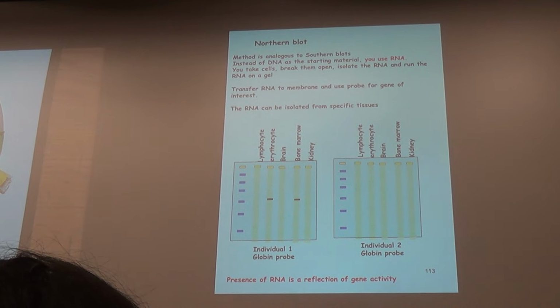And you'll be able to say, aha, now I know after 30,000 days, or however many years that is, you will get a picture of the entire human genome with regards to which genes are active in which cell types. So you can use Northern blots to do that. It's extremely slow and time consuming because you can analyze one gene at a time with one filter. There is a new method that was developed in the 1990s called microarrays. And that allows you to get a picture of the entire genome, all 30,000 genes, in one single snapshot.